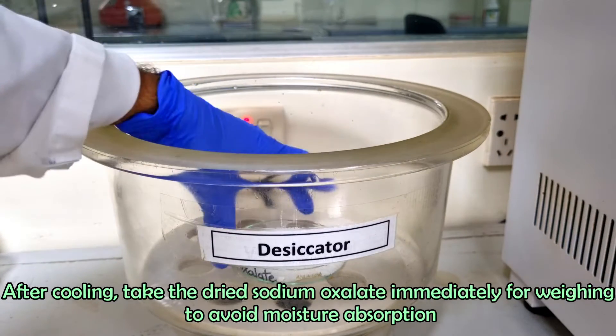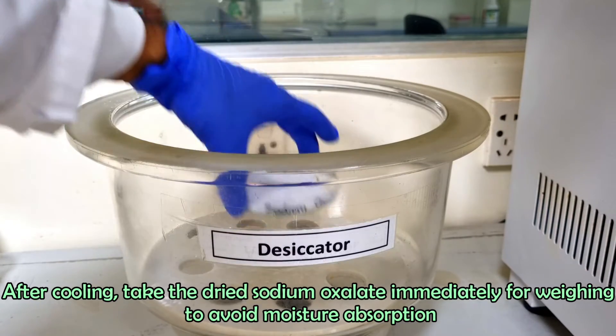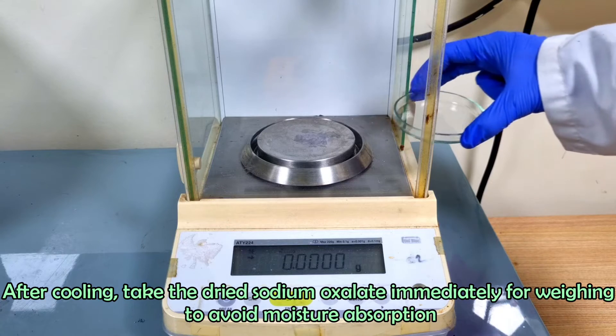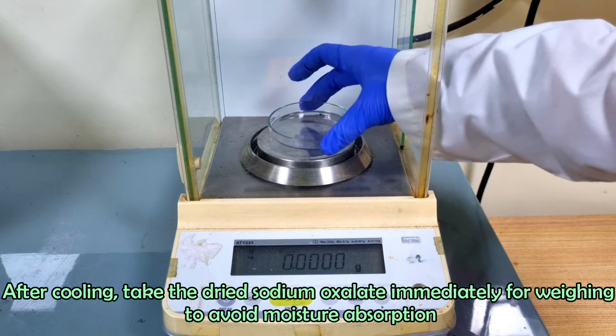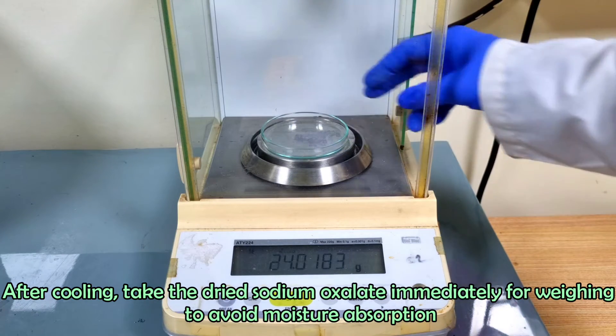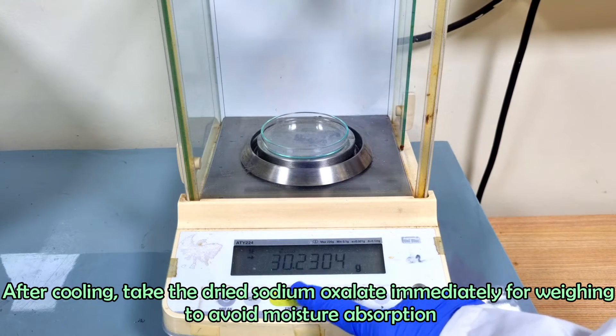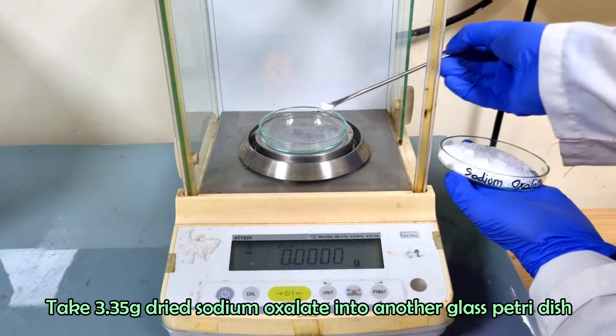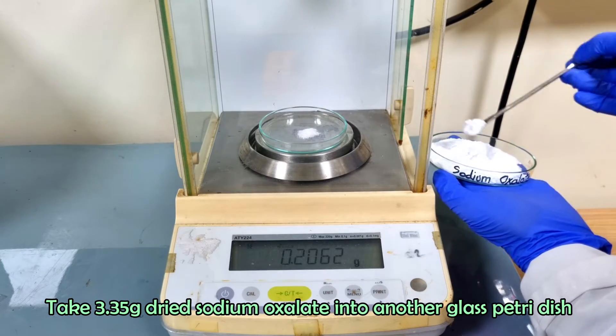After cooling, take the sodium oxalate immediately for weighing to avoid moisture absorption. Take 3.35 grams of dried sodium oxalate into another glass petri dish.